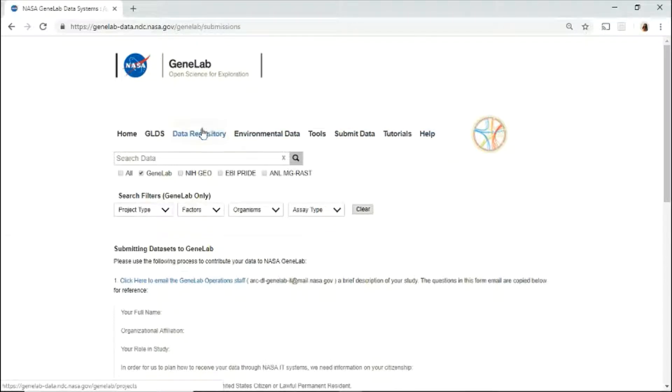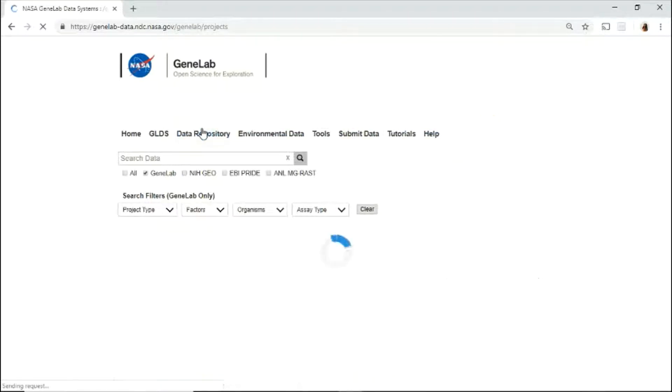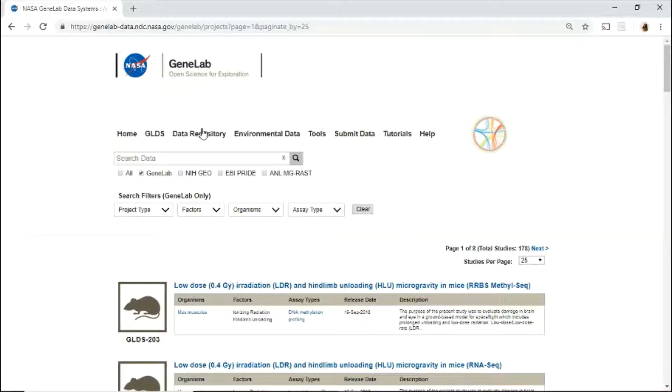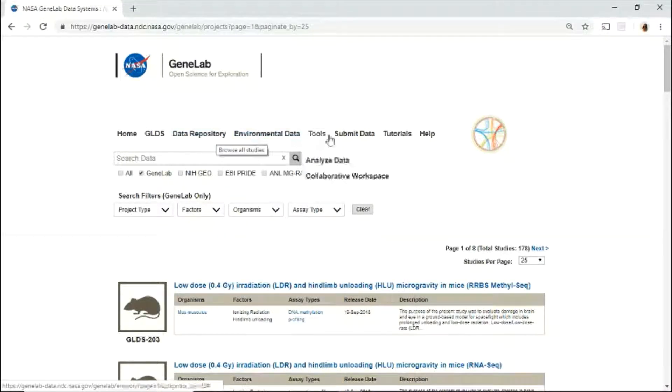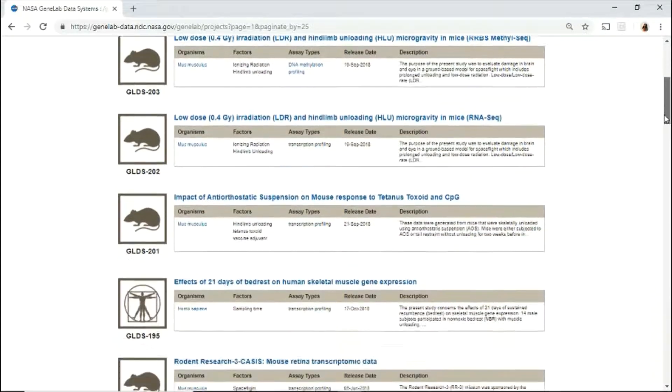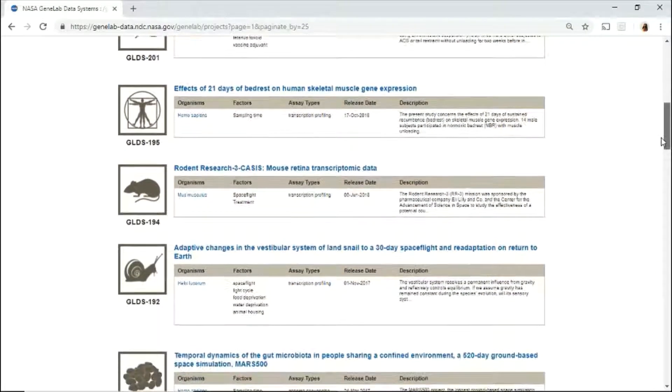Now, let's explore the data repository. The data repository lists all the available data sets in the GeneLab database.